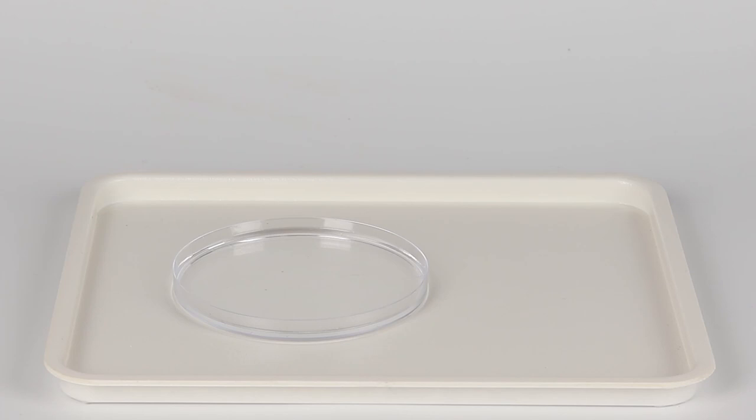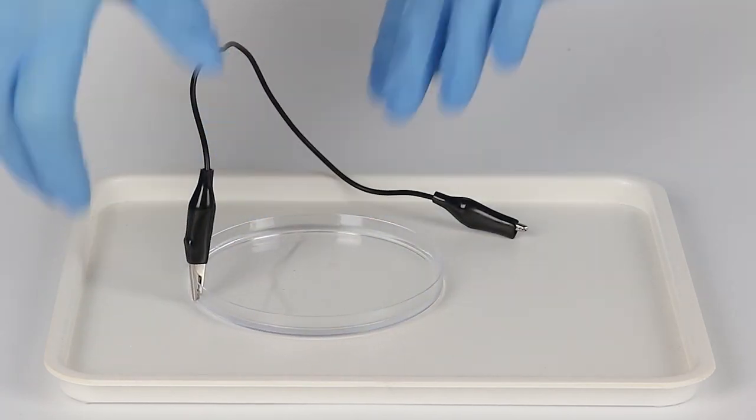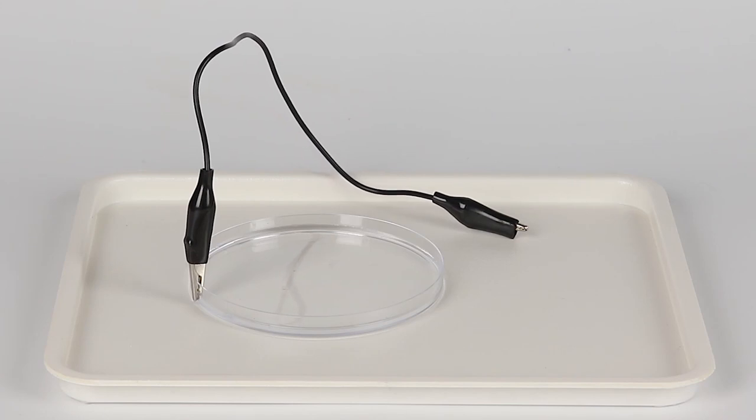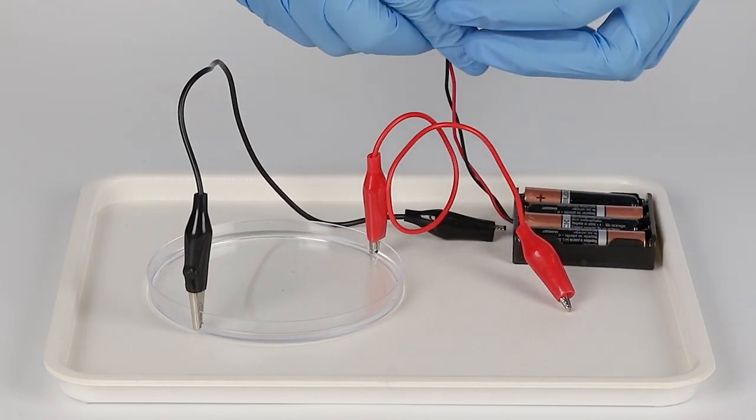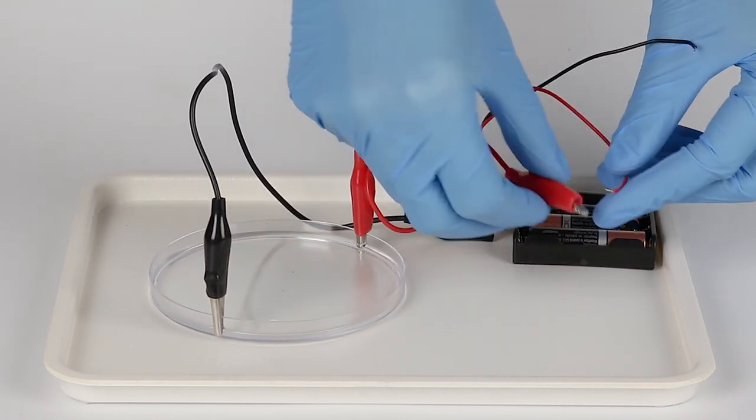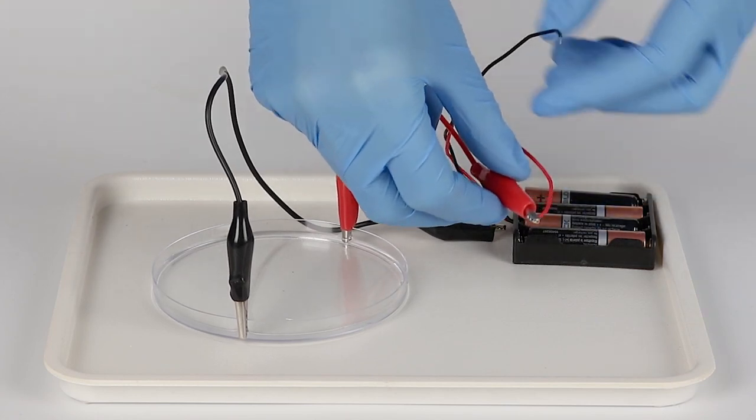Now attach the crocodile clip wires to opposing sides of the petri dish, so that the clips are touching the solution. Take the battery holder with the batteries and connect the red crocodile clip to the red wire of the holder. Do the same with the black wires.